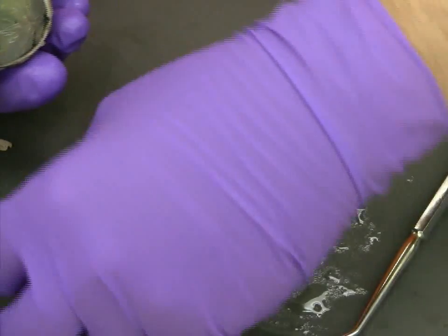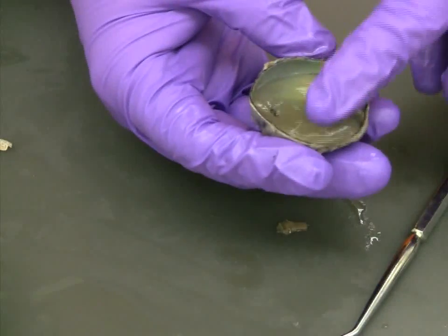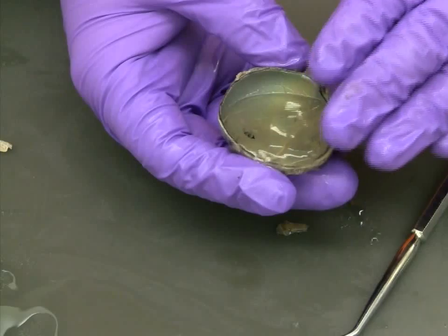Placing the vitreous humor back in the eye on top of the retina can help illustrate its original position within the eye.